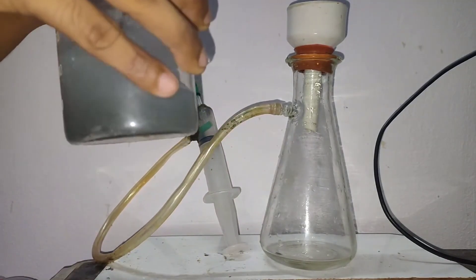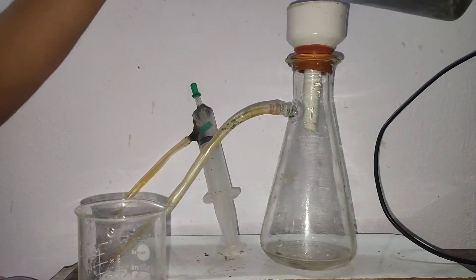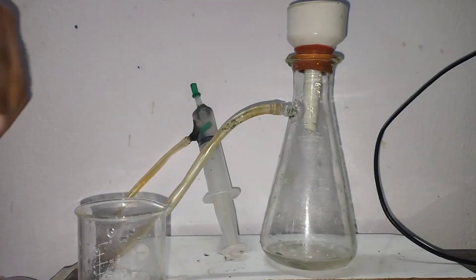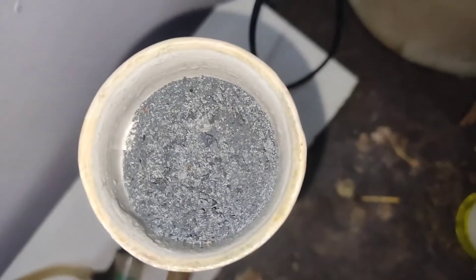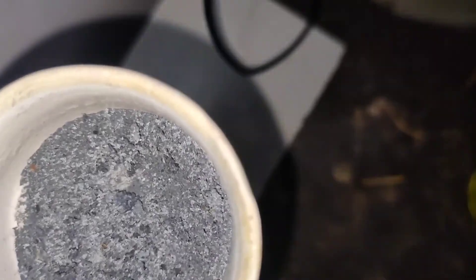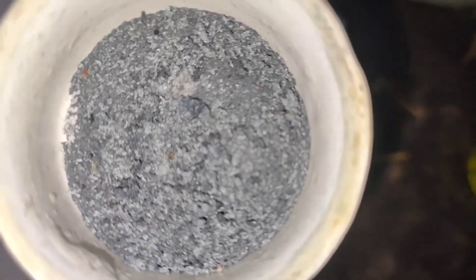I carried out a vacuum filtration, although a simple sedimentation and decantation would also work perfectly. I wanted to remove all the excess water from the crystals and make them as dry as possible. Then I placed the crystals in a desiccator.